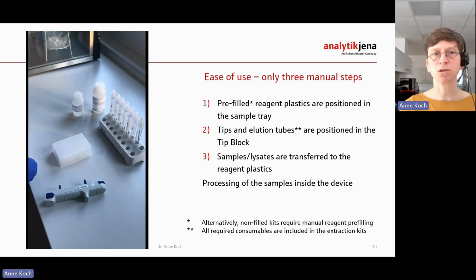And this video is just to show that it's actually quite quick and easy to also pre-fill those. But of course, all the kits are also available already pre-filled. You can see there pipette tips for the stepper that I will be using here. And what we are doing is that we reuse the pipettes for the same buffers over and over as well. Of course, you have to change them every now and then, but as long as you use the same lot, it's fine to use the same pipette there as well, just to also not create so much waste in the lab.